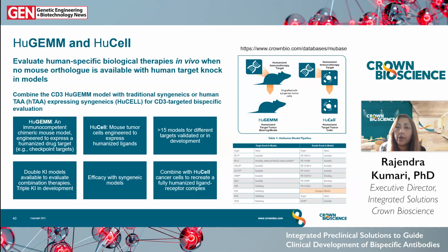So the alternative type of humanization is to substitute mouse gene targets with human counterparts, which is achieved by genetic engineering. So this is a knock-in both in syngeneic tumor cells, which are called HuCell, and in the mice, which are HuGEM, and this creates a new humanized mouse model. The HuGEM is an immune-competent chimeric mouse model engineered to express those human drug targets, such as those checkpoint targets. And the HuCell is the mouse tumor cell that has been engineered to express the humanized ligands.